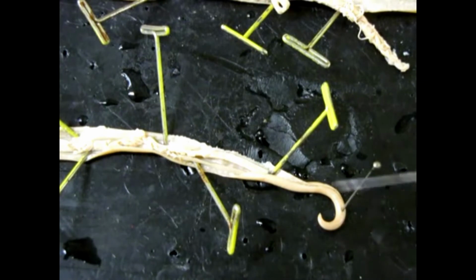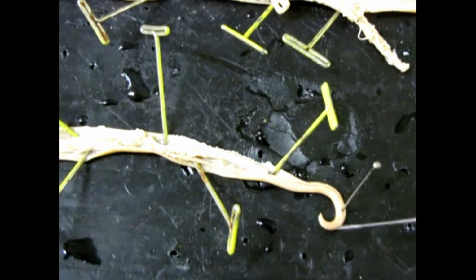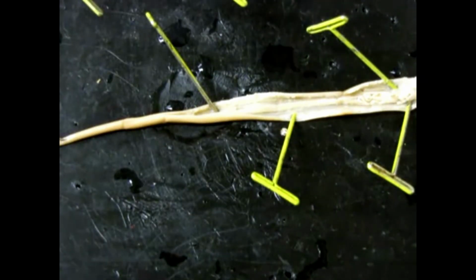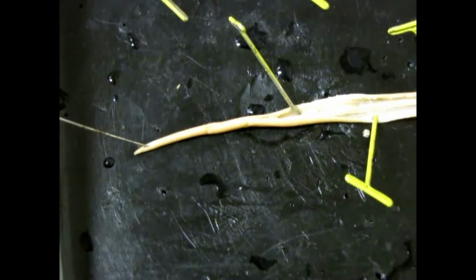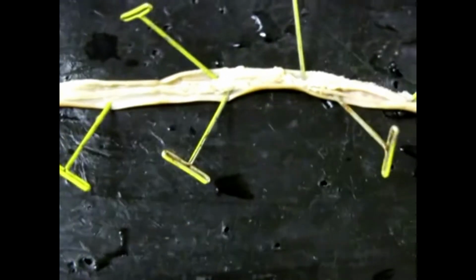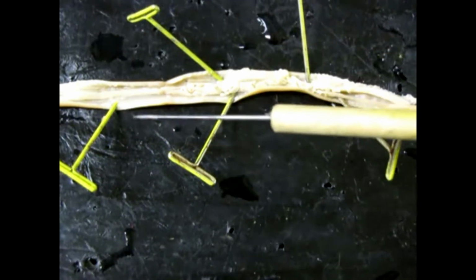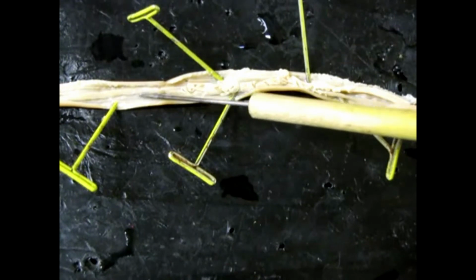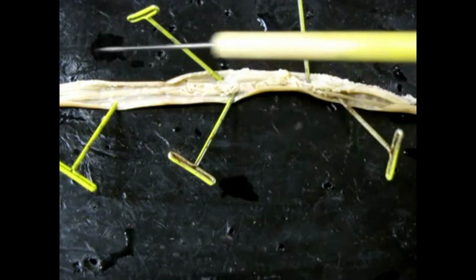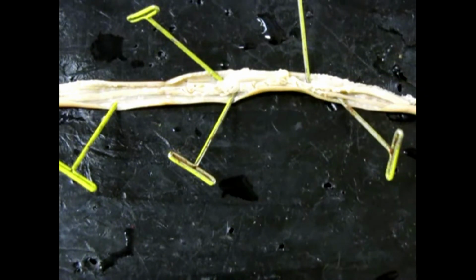You'll note right away that there is the hooked posterior here, so we're down at the posterior end of the animal, and then the anterior is that which has the mouth down here at the tip. Okay, so the setup in the male is similar in some ways, different in others. We can see again this very flat, thin, ribbon-like structure right here, running the length of the body from mouth to anus. That's the intestine.